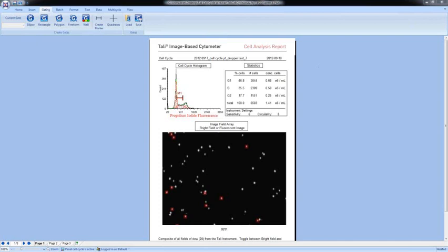All right, and are there any other questions that are coming through here? And Shula, there's a question, can you use the instrument for assays like annexin 5 staining? Yes, and there are a number of assays that have been optimized specifically for the instrument, including an annexin 5 staining assay. So we've got a couple of apoptosis assays that can be used with the instrument.